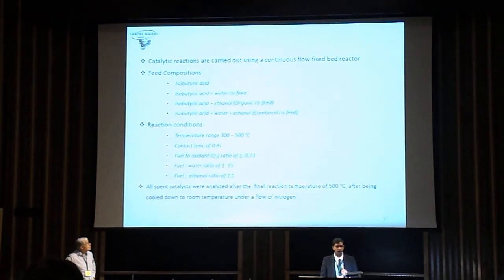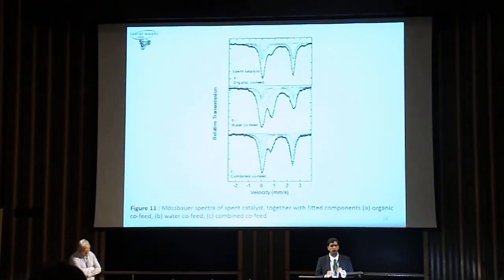We observed the same type of conditions for the cesium promoted iron phosphate catalyst, but unfortunately we didn't observe any difference in the formation of the iron pyrophosphate phase or the alpha phase with the promotion of the cesium. So my future work includes promotion with other materials like sodium and silver, to see the stabilization of these phases under the reaction conditions.